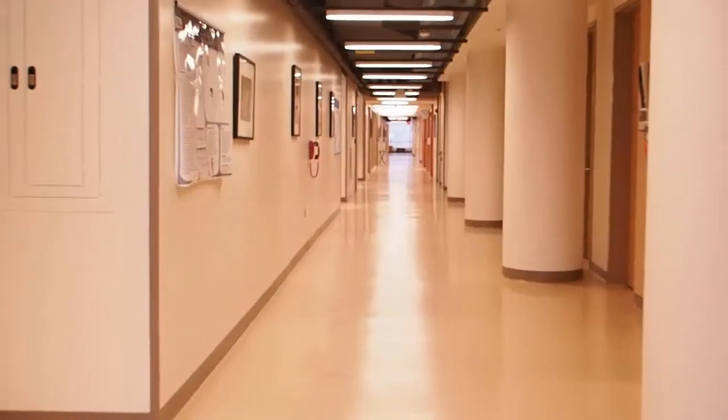We're here to talk about safety in the laboratory. And before we actually even go in the laboratory, we need to talk about what you need to do when you first arrive. First of all, before you go in the laboratory, you should identify the nearest exit you have for leaving the building should something occur that requires that. And so we have one over here, and we also have one down the hall.